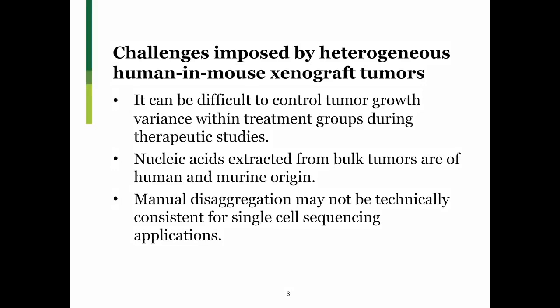The other aspect that can be challenging is that manual disaggregation may not be technically consistent for single-cell sequencing applications. And I'll show some QC data of some of our initial experiences with single-cell RNA-seq.